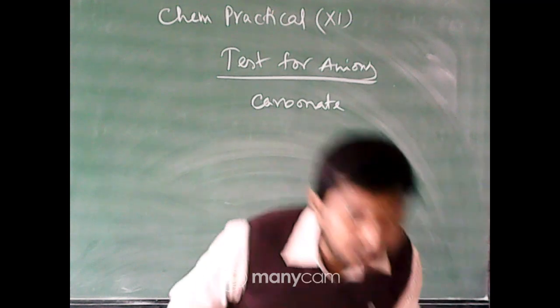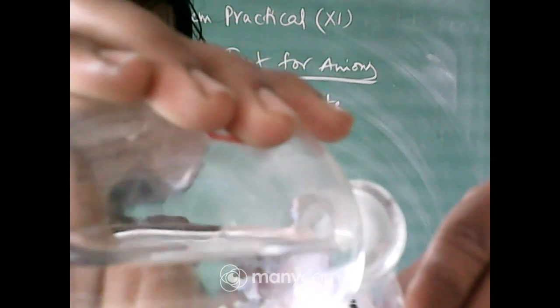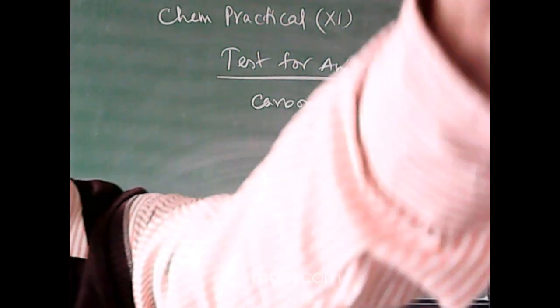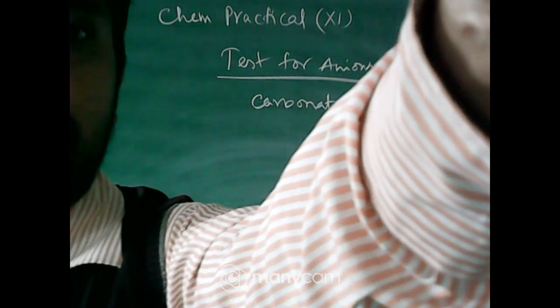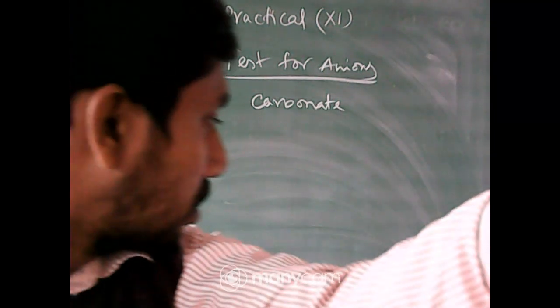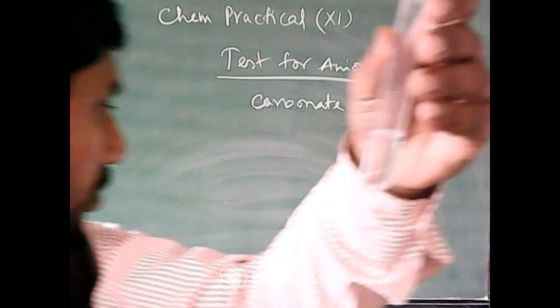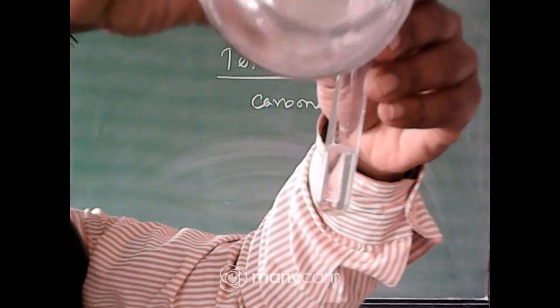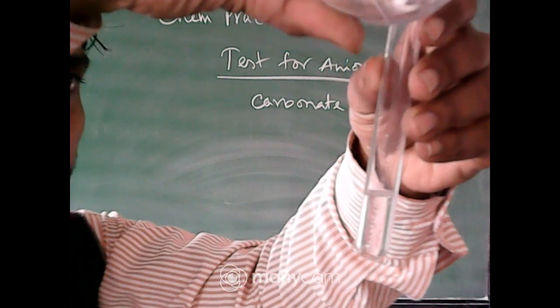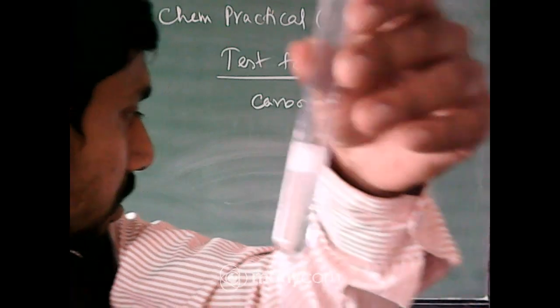Just look at that. Just see the effervescence of gases.